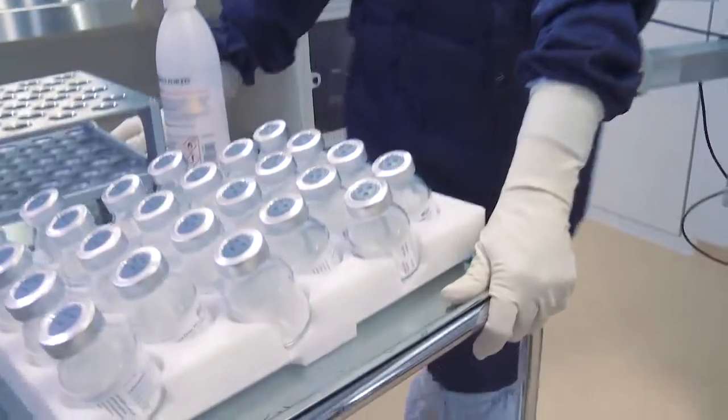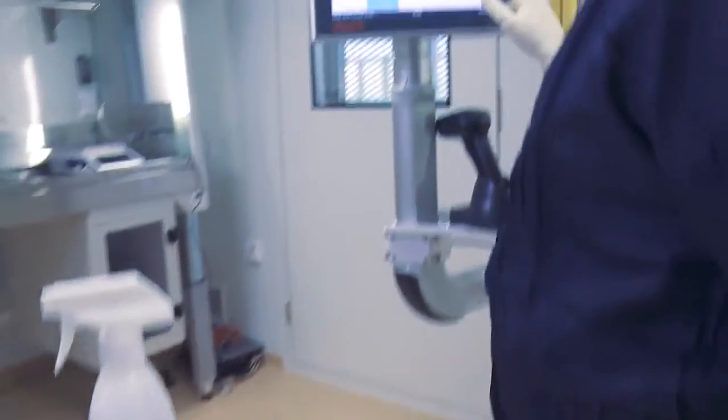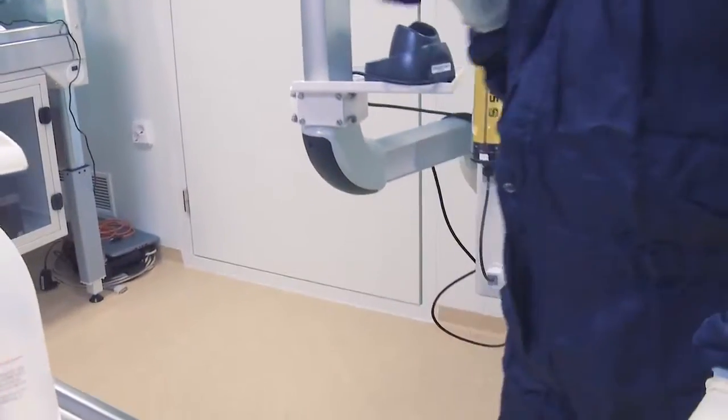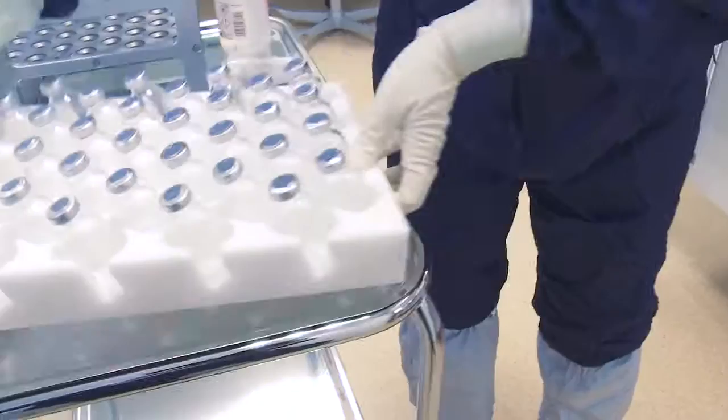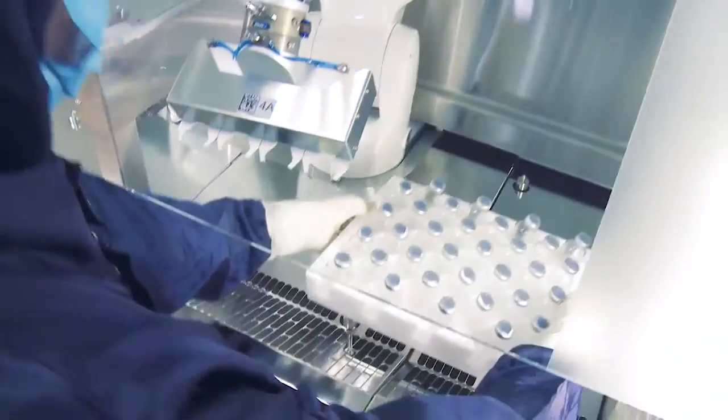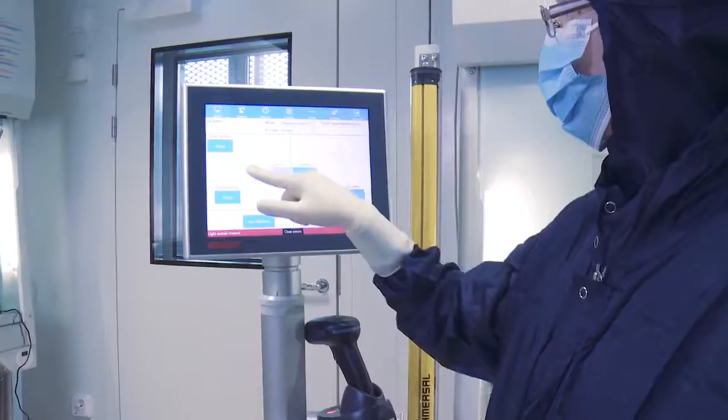The recipe for the product to be prepared is selected from the user interface. A barcode guarantees that the trays match the selected product. The trays are set in their places in the cabinet.